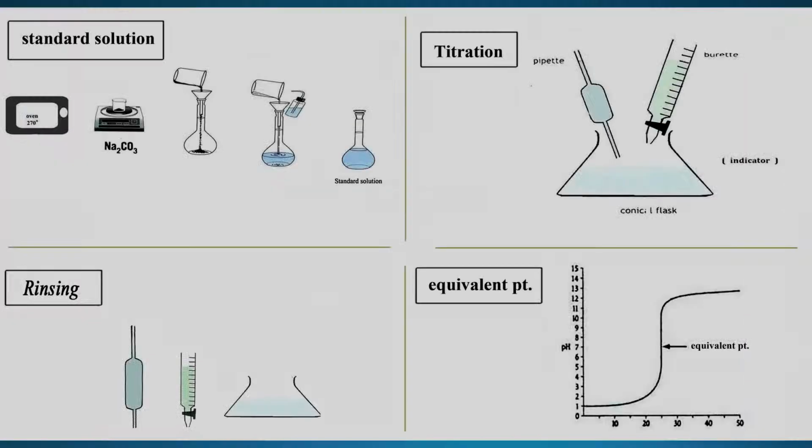Titration. We have 4 parts: standard solution, rinsing equipment, titration, and equivalent point. We start off with titration.